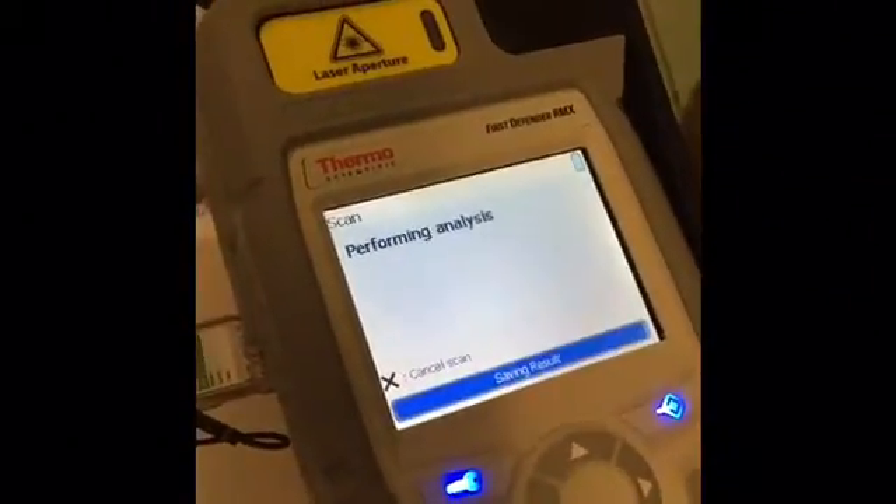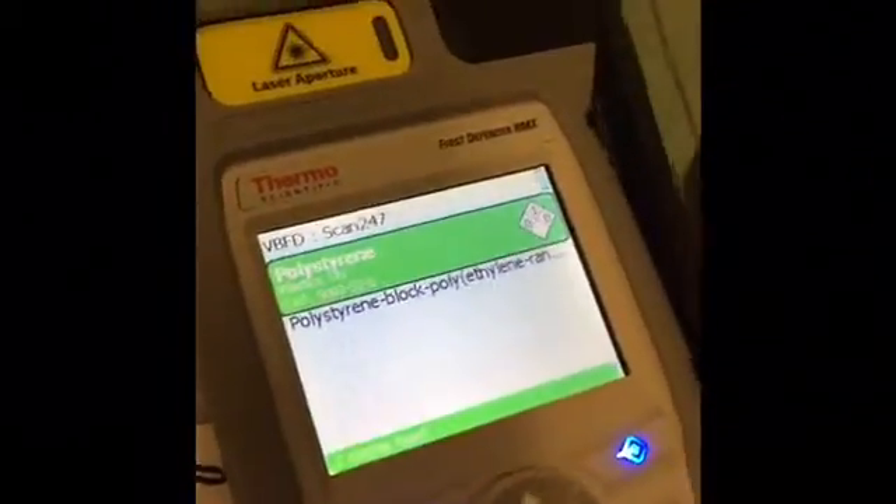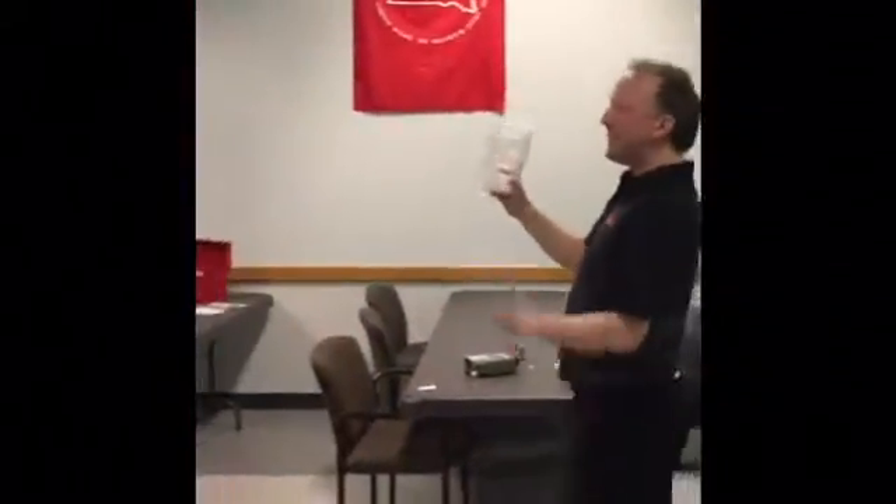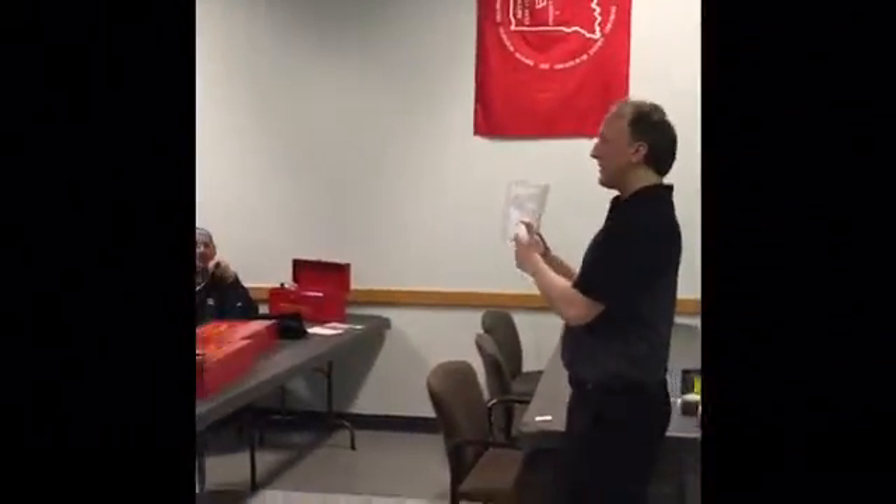If you get no signal strength, it won't tell you what it is? It'll actually give you some feedback — it might say four hours remaining and you know you're not going to get it. I think it scanned the container, because it says polystyrene. These containers don't look that thick, but it got the polystyrene — it got the plastic itself.